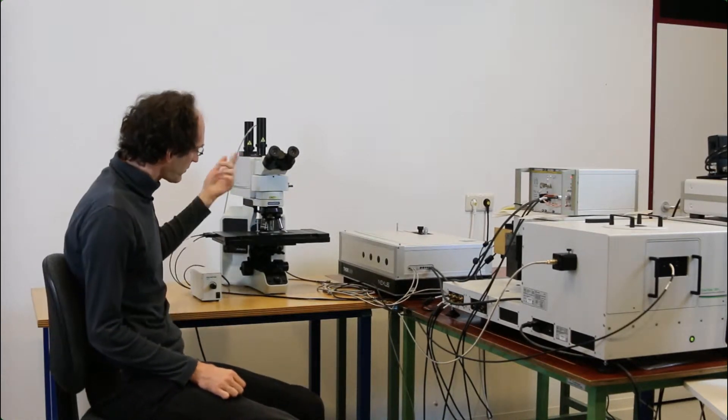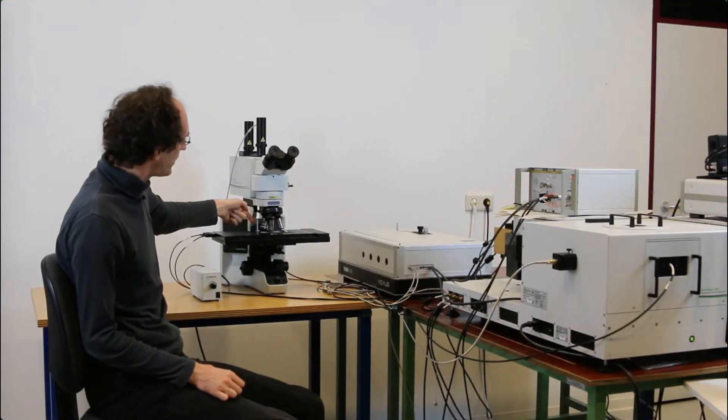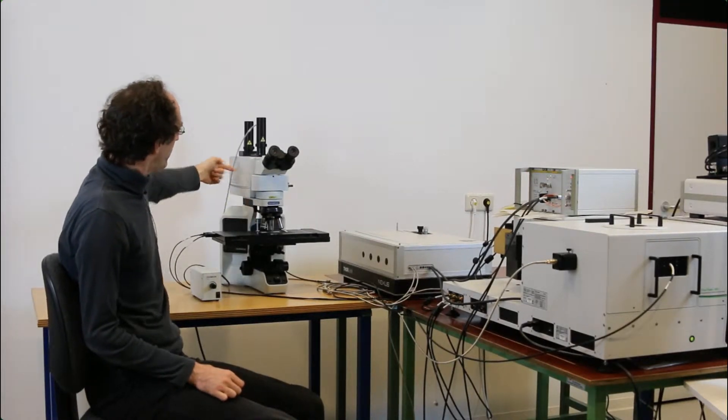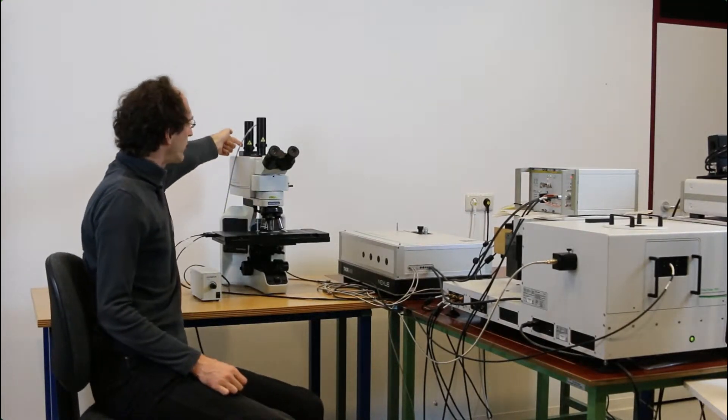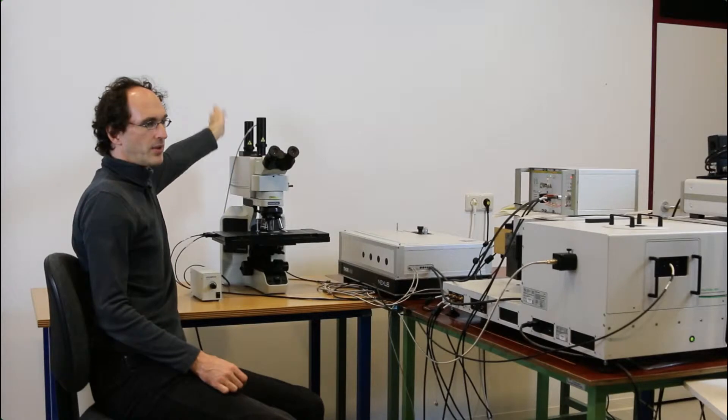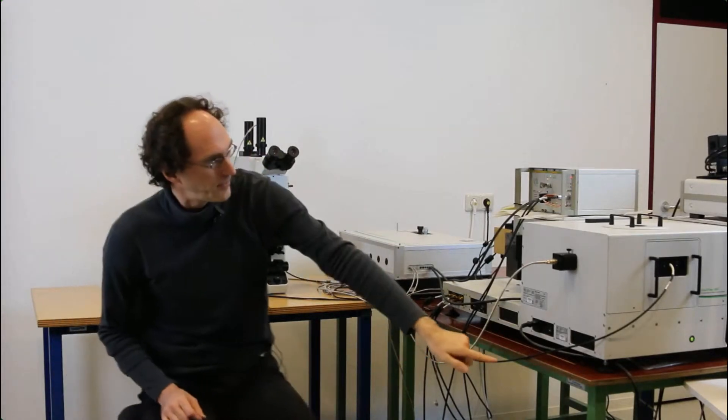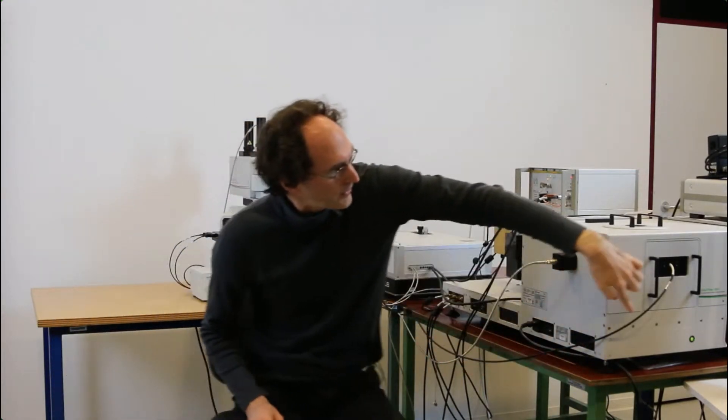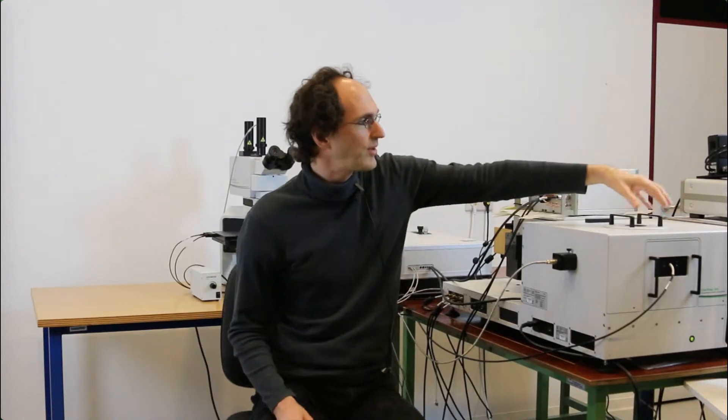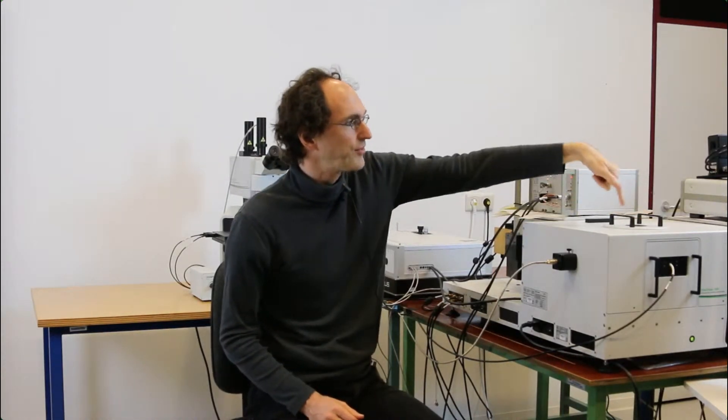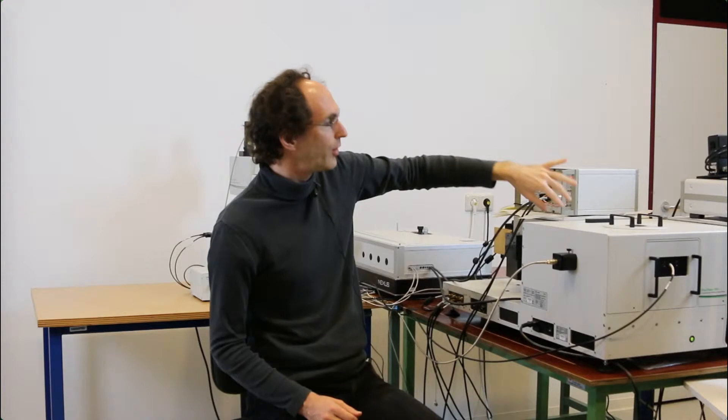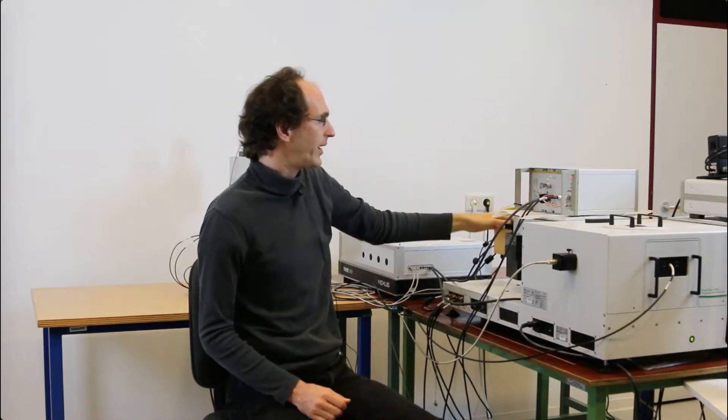The fluorescence that is collected here is actually focused into this fiber. From there, this fiber is delivered into some kind of fiber drawer. Inside there is the open fiber end, and the fluorescence is focused onto the grating and from there onto the detector.